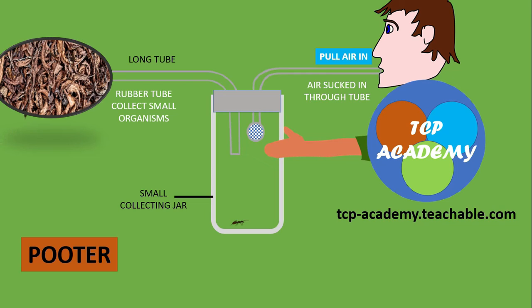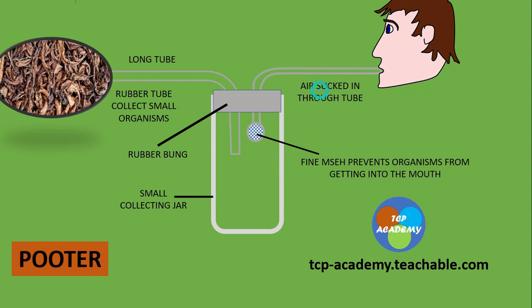So the force is applied. Air is actually sucked in, and in so doing, you would have seen one of the ants there being pulled in. Let's go again. There it's repeated. So with each pull, you'd observe that an ant is being pulled into the bottle.